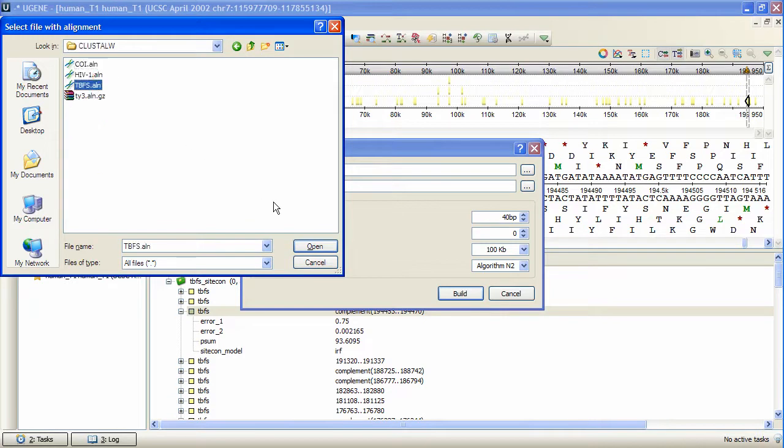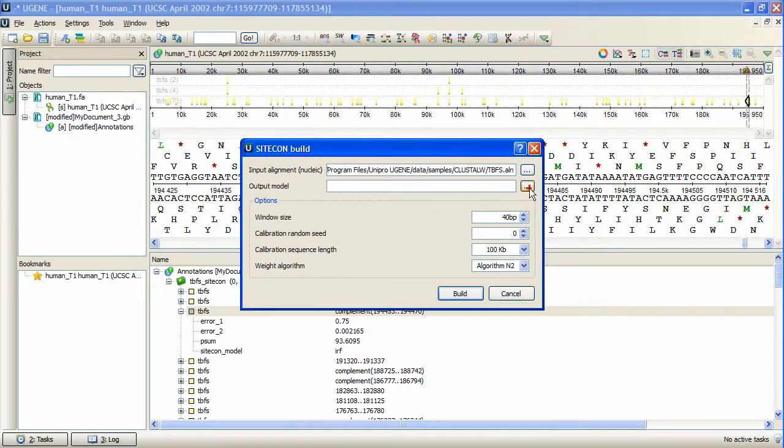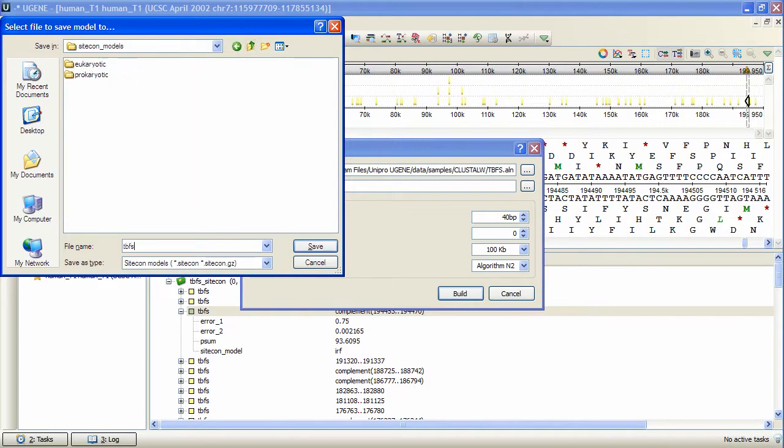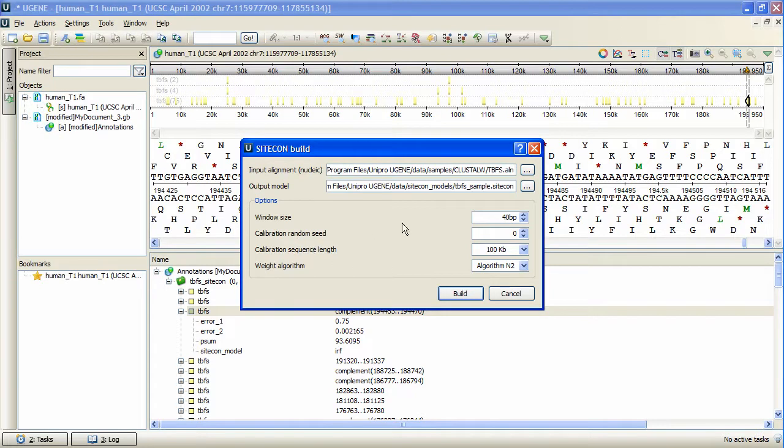And output profile location. After that, window size and weight algorithm may be selected.